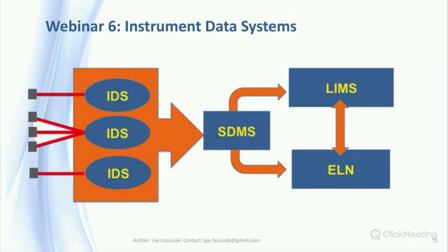This webinar will look at those data systems, the processes that affect your data, the choices you face in designing an informatics architecture for your lab, and the silo effect. We'll also look at the roles lab managers, personnel, and support have in selecting and managing those technologies.